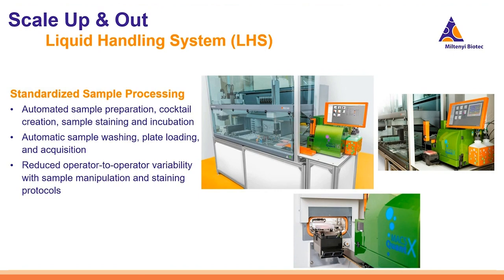And really, this reduces the operator to operator variability with any sort of sample manipulation and staining protocols, because with the robot making your cocktails for you, you can assure that it has the correct volume each time and will reduce any sort of variation with operator to operator differences in pipetting, in leaving an antibody out, especially as you scale up and try to really automate the whole workflow.